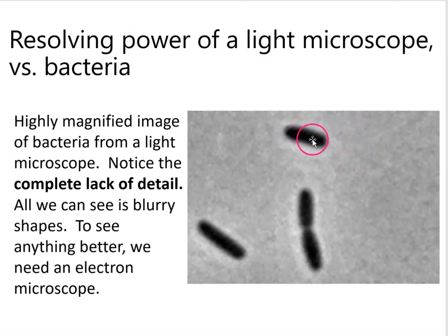So light is refracted a little bit differently through the cells, and it blocks light that has come through cells, and it makes cells dark against a light background. So that's another trick to give contrast. And in the lab, we have a few microscopes that can do that, but mostly we're going to use stains to generate contrast.